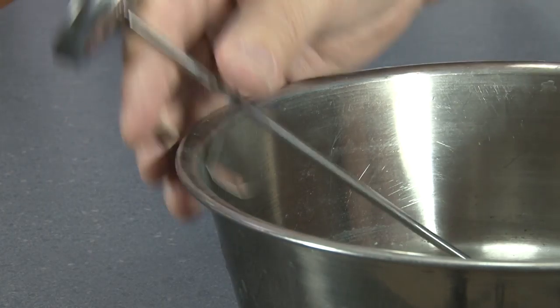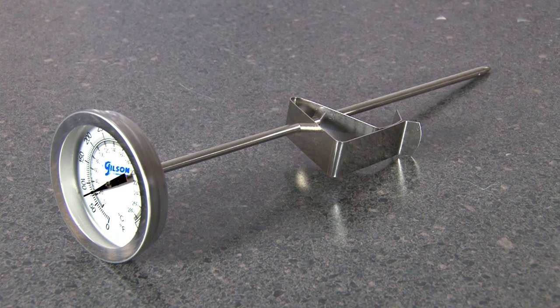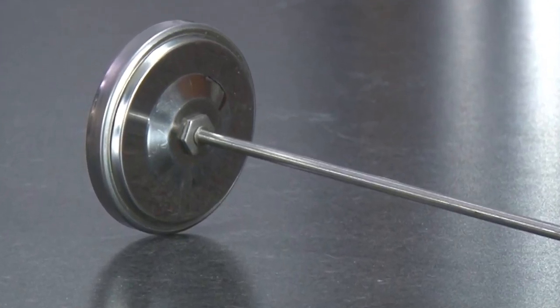Gilson's dial thermometers easily mount on labware, and these analog bi-metallic dial thermometers can be calibrated using their adjustment nut.